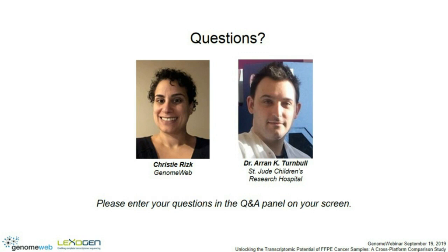You can also combine, so for example, in this data set, we were actually combining several data sets from different studies, and in reality you probably wouldn't do that. This has been more of a technical thing that we've done here when we were integrating 7 different platforms, more to show that it's possible as an example. So the one advantage is that we did that all with one iteration of ComBat, which would not be possible with XPN. So yeah, we have extensive familiarity with both, and we've used both quite extensively. Those two would be my preference.